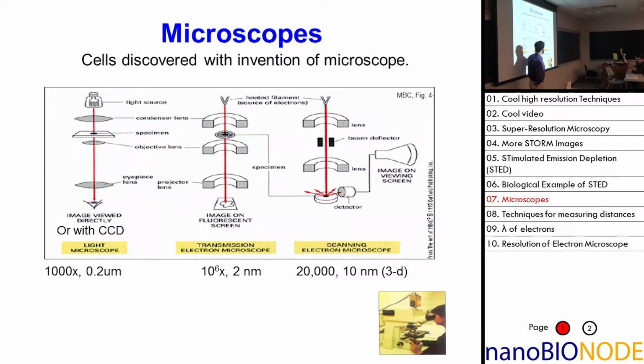That's one way. That's called a transmission electron microscope, and it gets very good images. Very good, meaning really high resolution. There's another way that you can put instead your detector here. You can look at the scattering. And this is generally called the scanning electron microscope. It gives you really neat pictures. Okay?